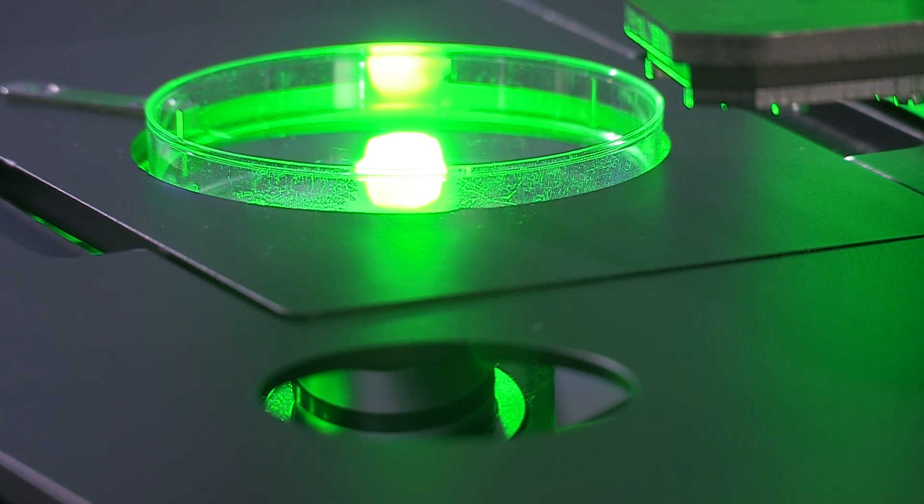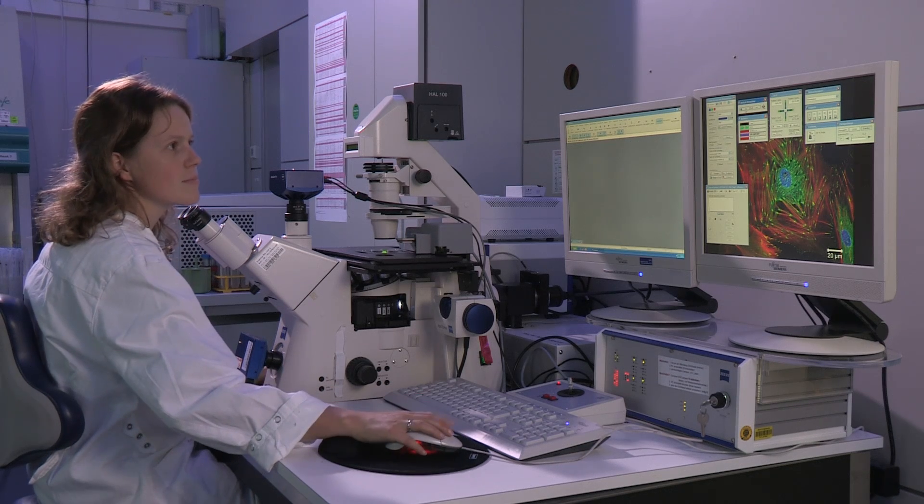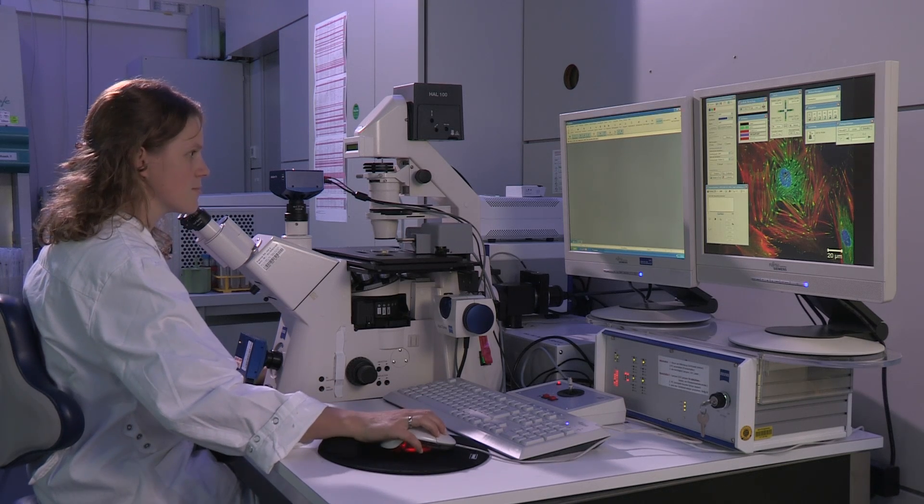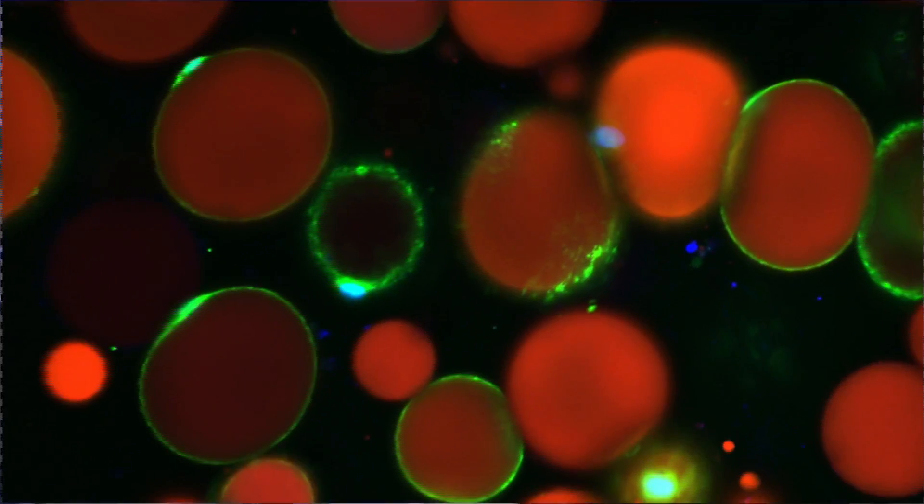The Fraunhofer IGB enables the production of tubular supply systems, which can be used in bioreactors and the assembly of three-dimensional bio-artificial tissues like fatty tissue.